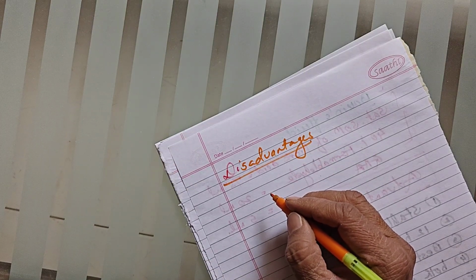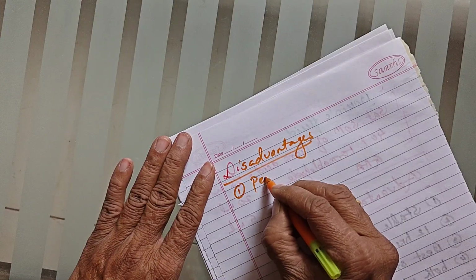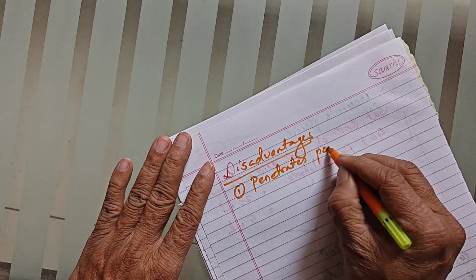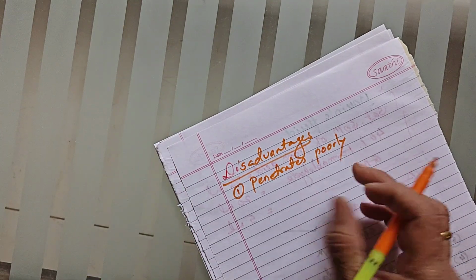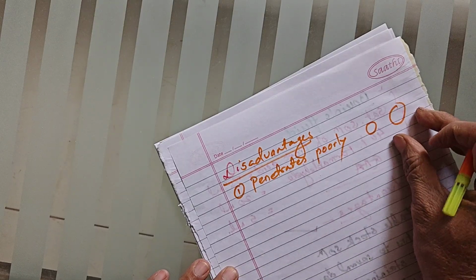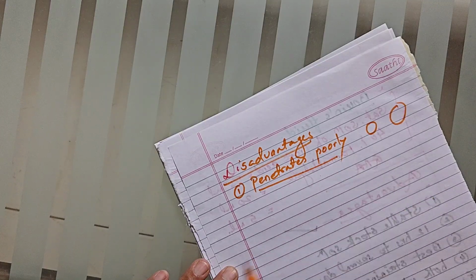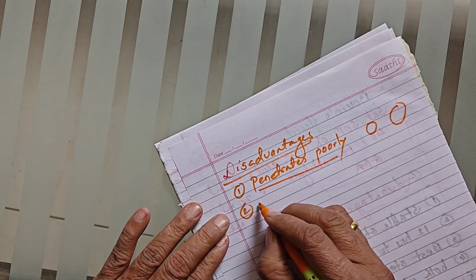Bouin's fluid penetrates poorly, so its usefulness is restricted to small pieces of tissue only. It is not recommended for large size tissue because of its penetration power. The second disadvantage is the picric acid used in Bouin's fluid.